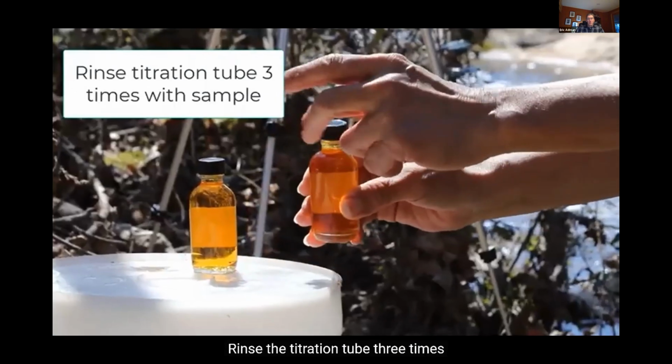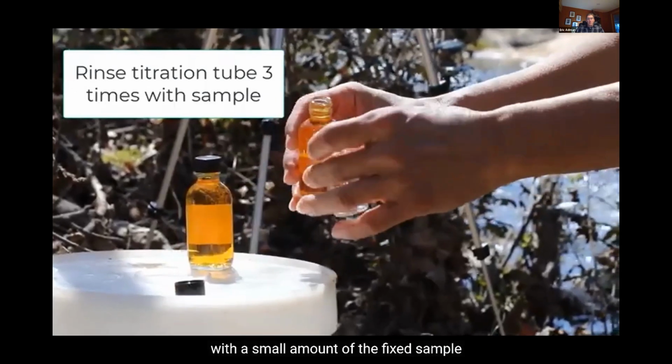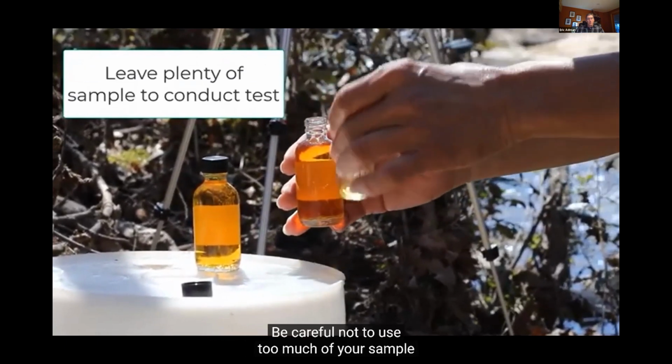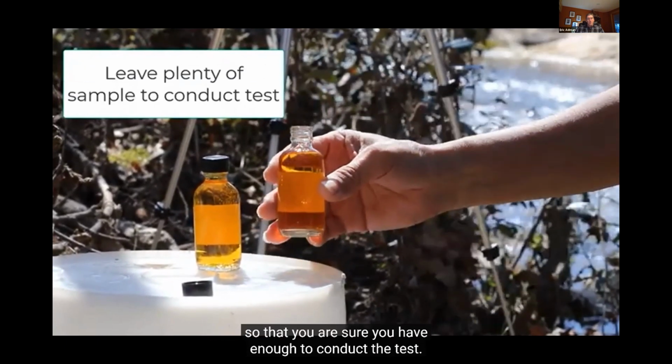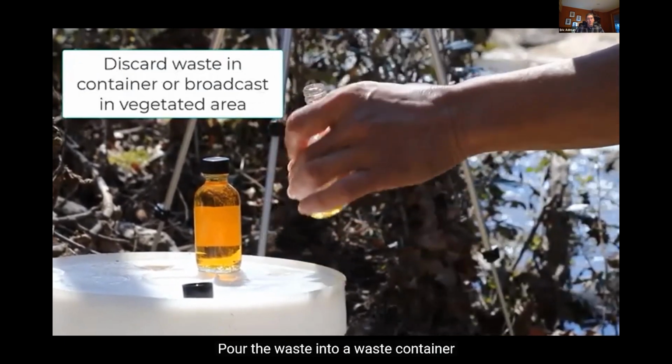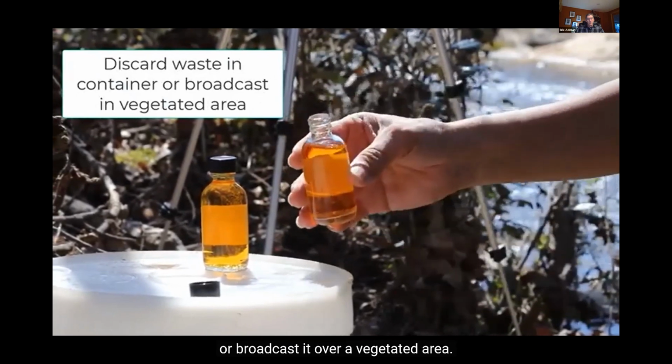Rinse the titration tube 3 times with a small amount of the fixed sample from the first sample bottle. Be careful not to use too much of your sample so that you are sure you have enough to conduct the test. Pour the waste into a waste container or broadcast it over a vegetated area.